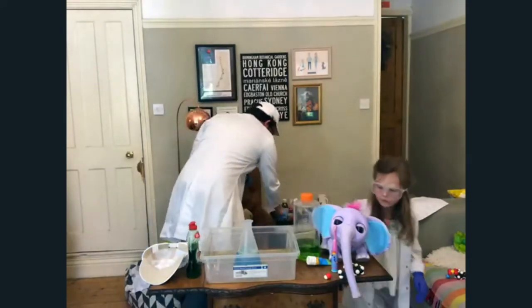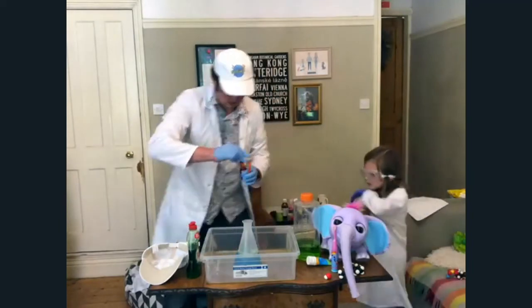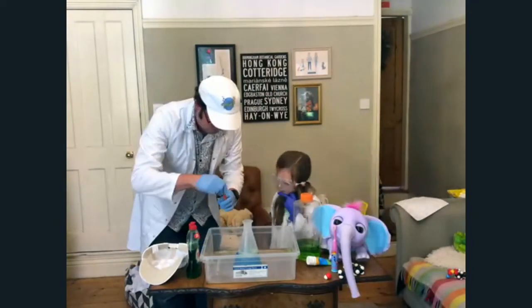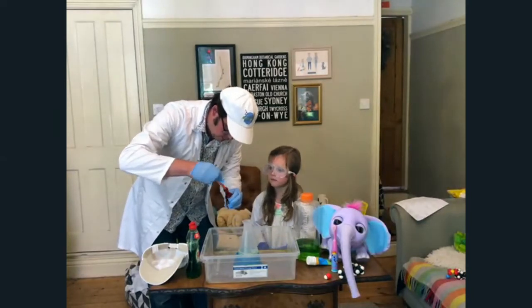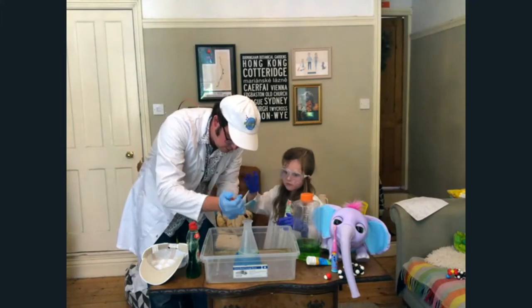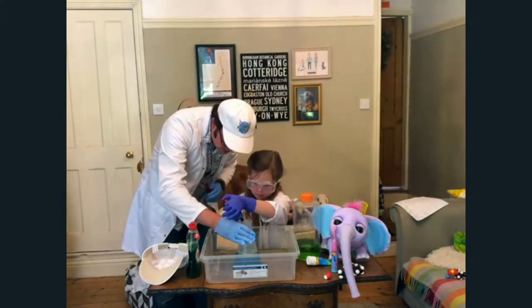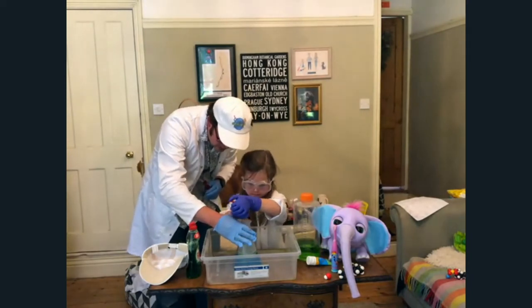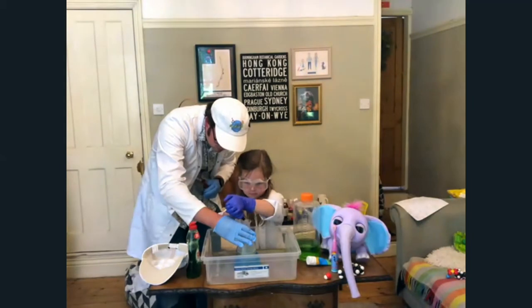You can use this. Betty, come around here. So what I'll do, just put a little bit of that. Well, let's make sure you just put it around the edge. Okay, just a little drop around the edge. A bit more. One more. There you go.